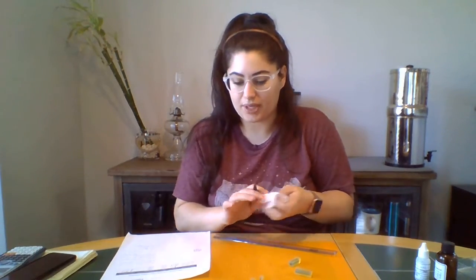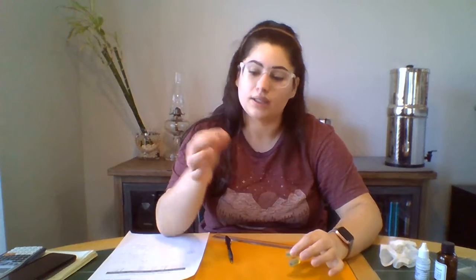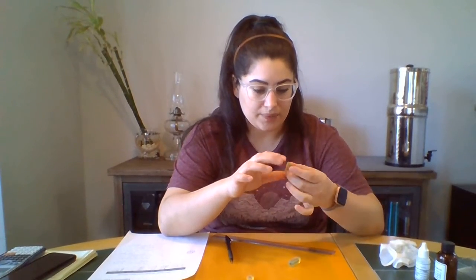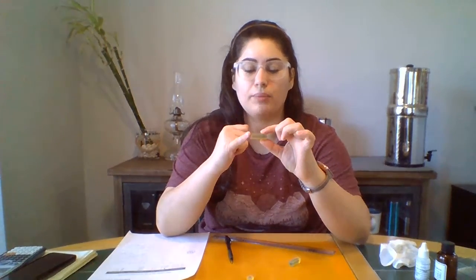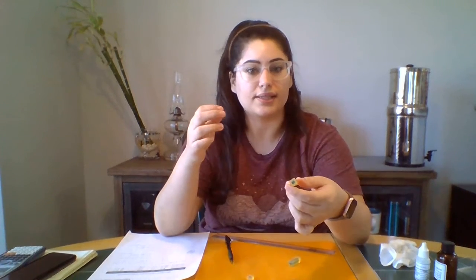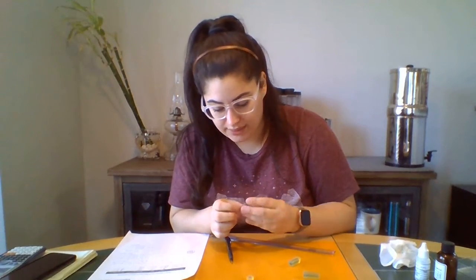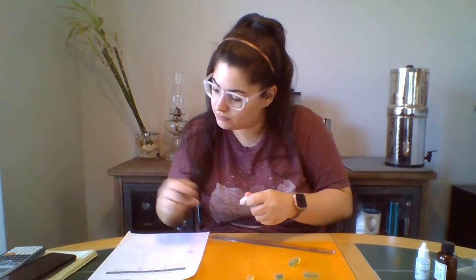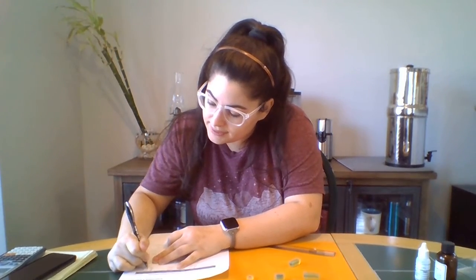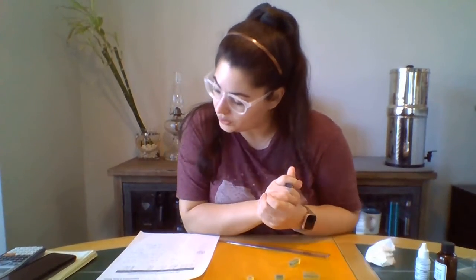0.25. Interesting. So that's what I had guessed, that these two would be closer to complete diffusion. Obviously this one more than this one because this had the length and this was just 1 centimeter by 1 centimeter. And it's definitely not as blue. The color has gone way more on the ends, which makes sense, than in the center. It's darker in the center, you can see. But this one, it's still pretty dark. So I wonder if all three of them were supposed to be the same. Or not.